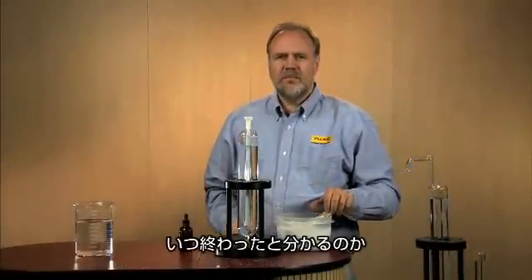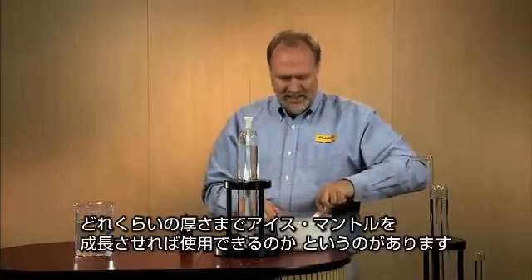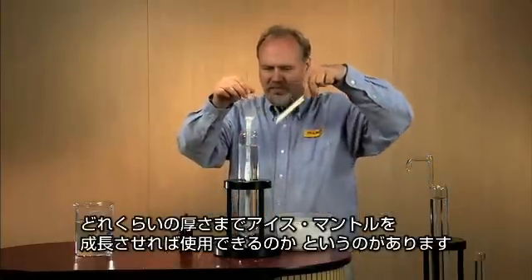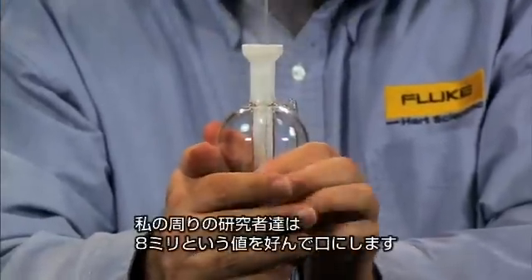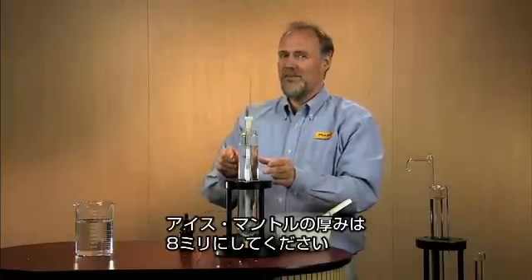One of the most commonly asked questions is: how do I know when I'm finished? Or how thick does that ice mantle have to be before I can use it? The scientists I work for like to throw out the number eight millimeters — we want your ice mantle to be eight millimeters thick.